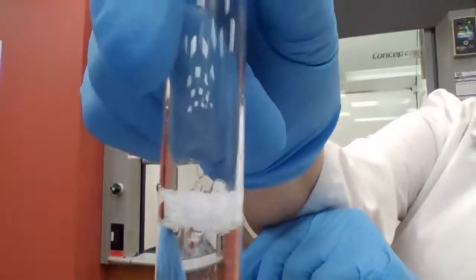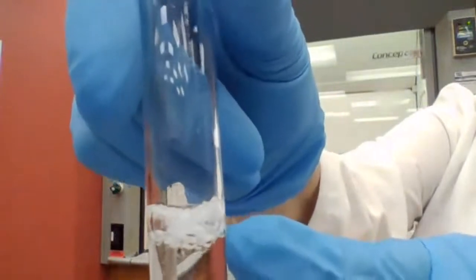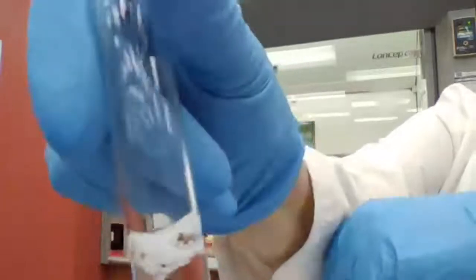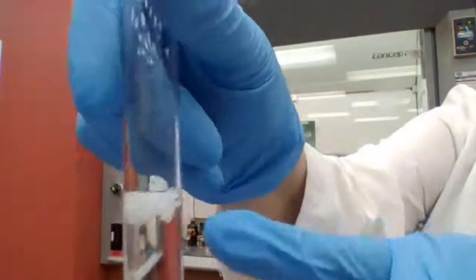And if I wait long enough, this is going to actually disappear because of the weak base, so it is dissolving, but dissolving slowly. If you see the size of the bubbles are changing now, because new gas is being produced, that means the reaction is actually taking place and carbon dioxide has been released.